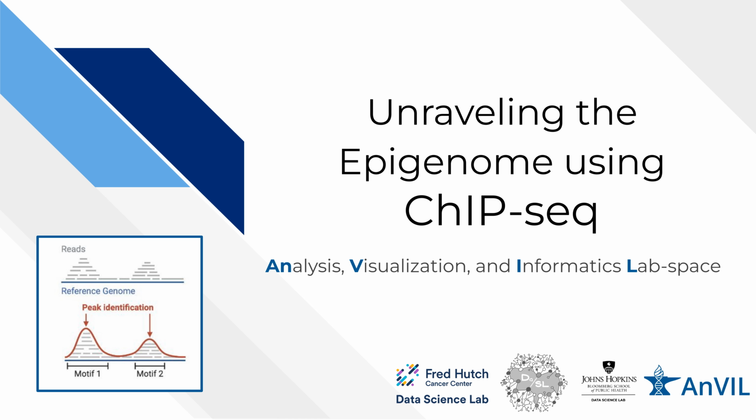In this lesson, we'll talk a bit about how you can analyze the epigenome. We'll focus on a technique called ChIP-seq.